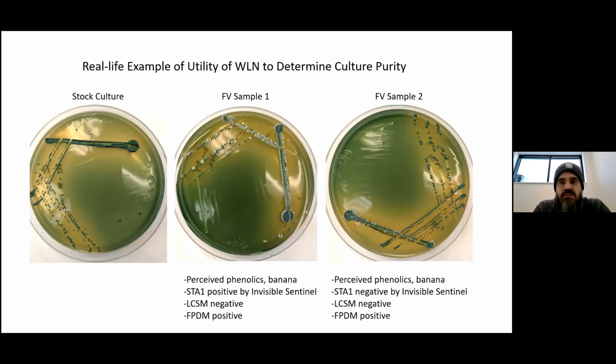They weren't using a Belgian yeast, just a clean American ale strain. So I said, go ahead and send us a sample, because the first thing I want to do is try to plate it on WLN.